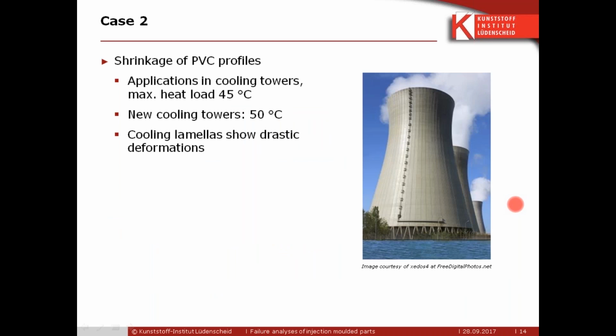However, it's actually a polycondensation. It's kind of a mixture between an exo condensation reaction and the endo evaporation of the water that is building. So it's kind of, well, it's a peak. So obviously something happened to this cast polymer. So that kind of explains the peak. You didn't dig into the root cause of this peak, but you could clearly see that the difference in the production, what the customer is interested in, or in the failure, comes from the molecular weight distribution.